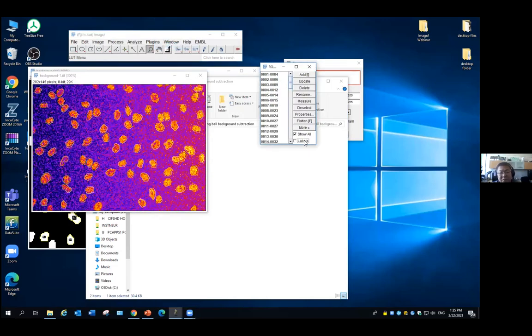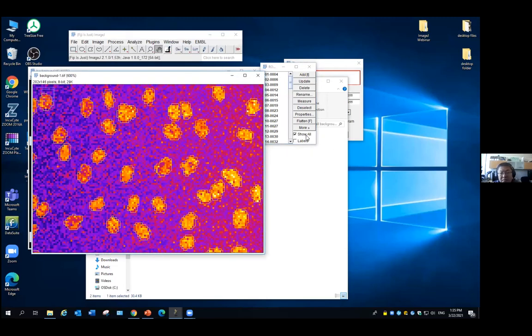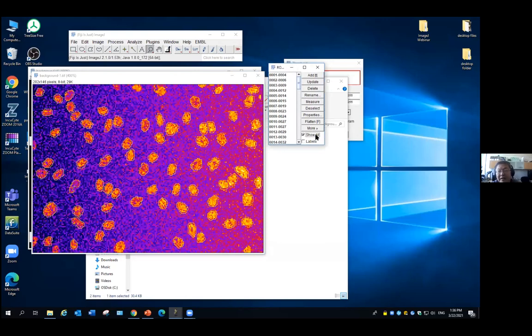This is our selection. So I would say, I'm not a very high standard guy, actually. Really, I would say it's actually pretty good. Consider our incoming data is actually not very good data. And all we did is a background subtraction. We corrected that the background on the right side is higher than the left side. And then we did a Gaussian blur smoothing. We corrected the problem that our image is noisy. And then we go directly to the thresholding.